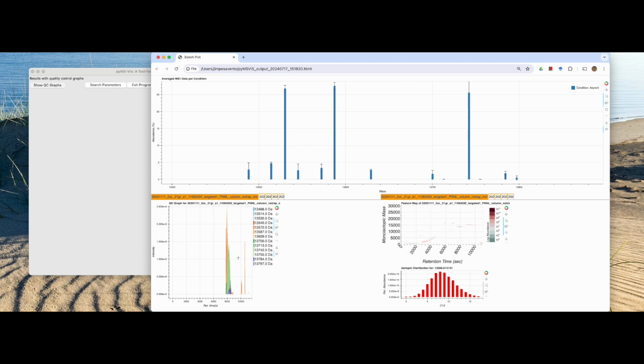However, as I mentioned in the previous tutorial, you don't want to just stop here. Always look at your data. The tabs here show the different data sets that were analyzed. Just quickly scrolling through them, you can see some of them have quite different elution behaviors because different columns, different conditions, and different instruments were used.